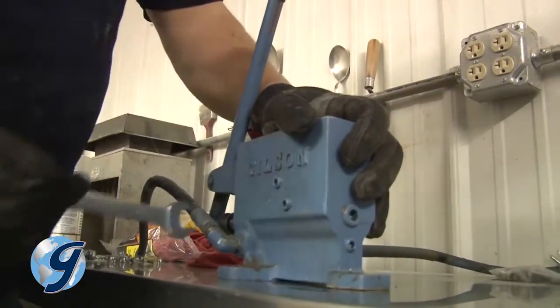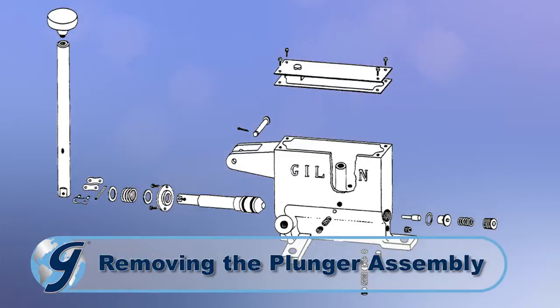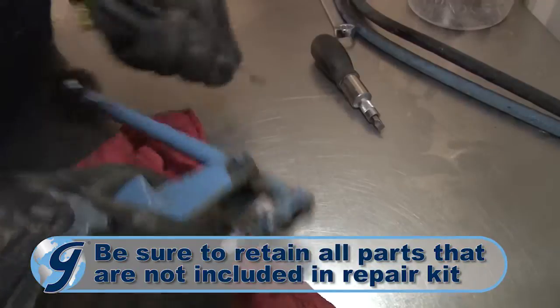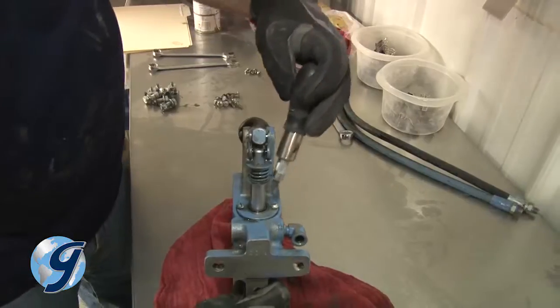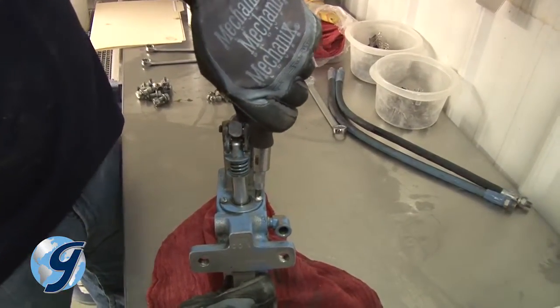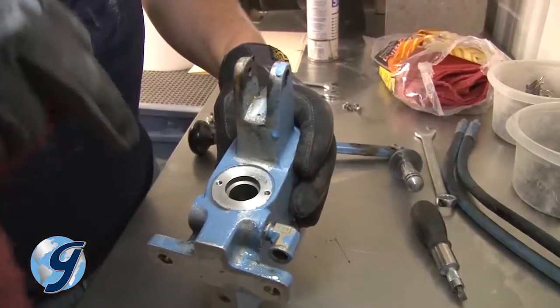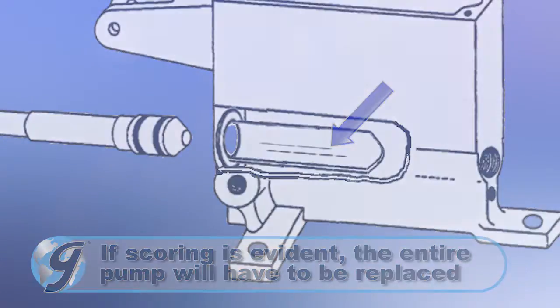Now remove the hydraulic lines from the pump. Next, remove the cotter pin from the pump handle assembly and pull the pin. After the handle has been freed, take out the two screws from the plunger guide and seal. Now remove the plunger from the pump body and inspect the plunger and pump housing to make sure that there is no visible scoring. If scoring is evident, the entire pump will have to be replaced.